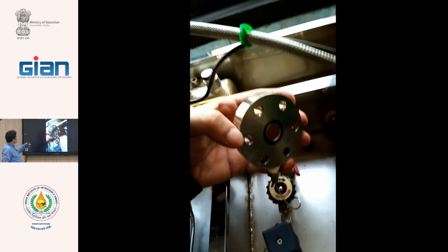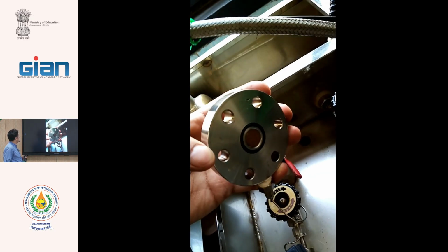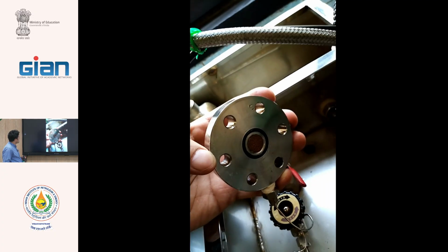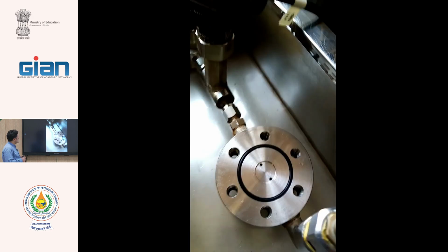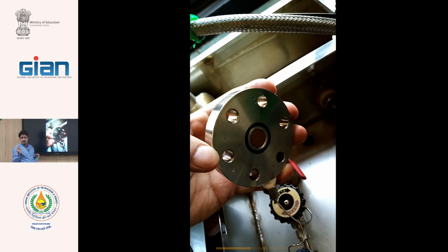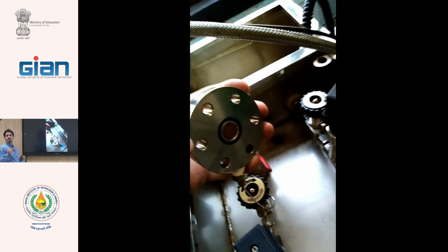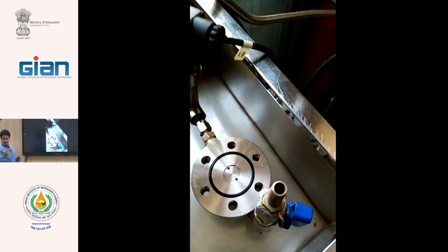We have 2 O-rings for sealing the system. The effective diameter is 3 centimeters because the gas separation polymer is very expensive. We do not test a big one.